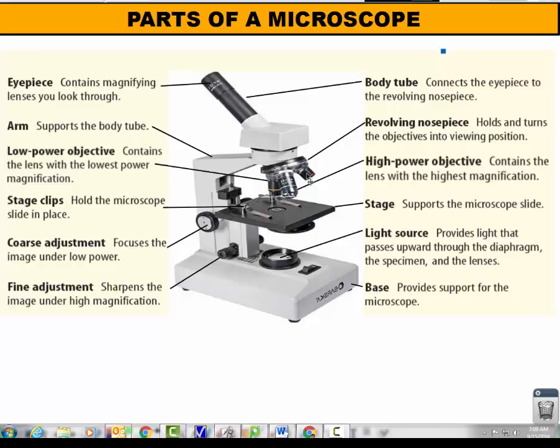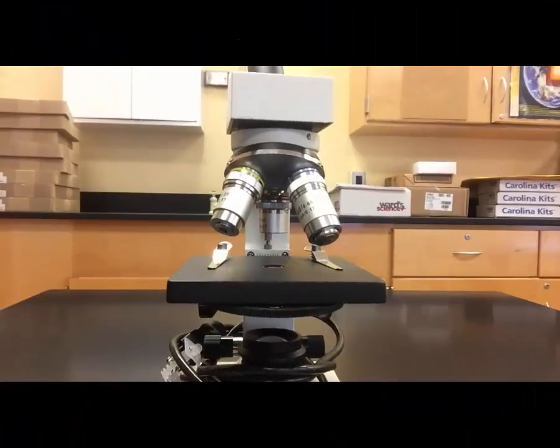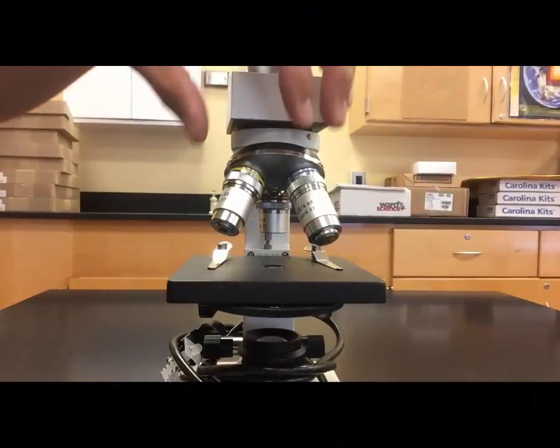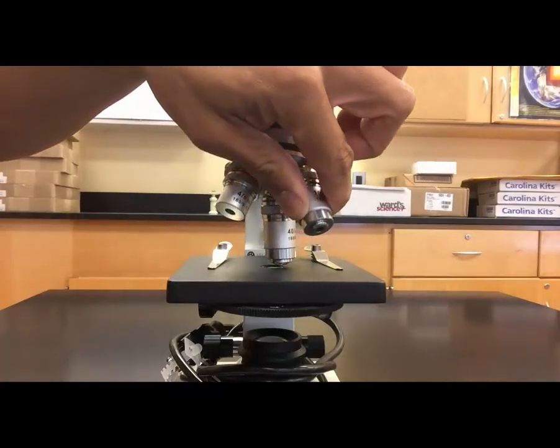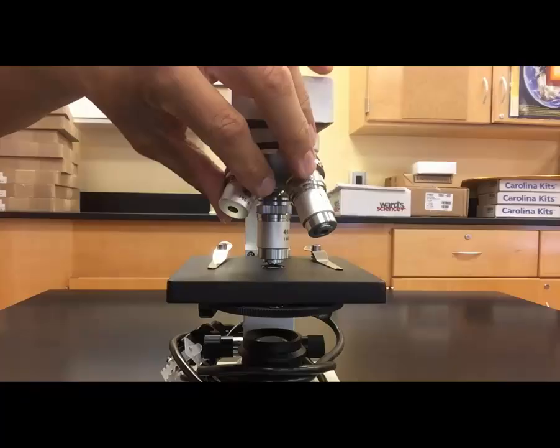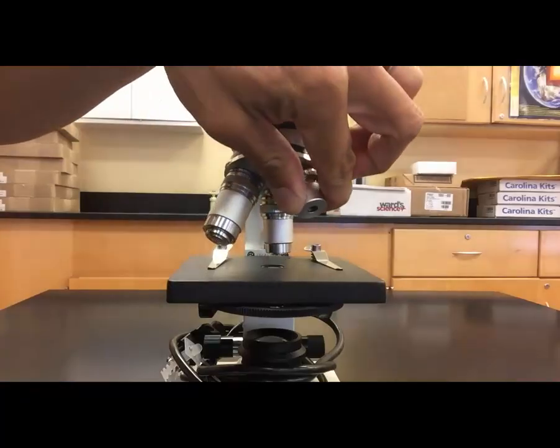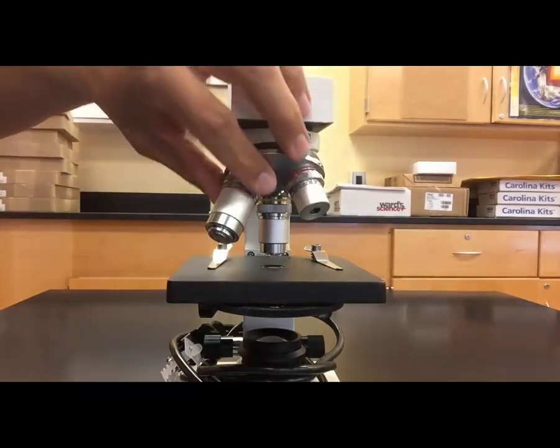Now let's take a look really briefly on how to use the revolving nosepiece to click an objective lens into place. To select the proper objective lens is simple. All you have to do is rotate the lenses until they click into place as you can hear in this clip. And that's all you have to do.